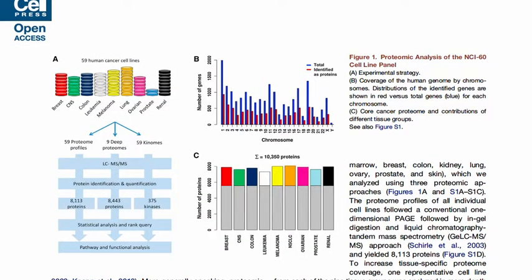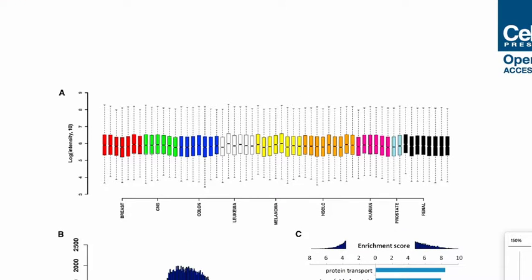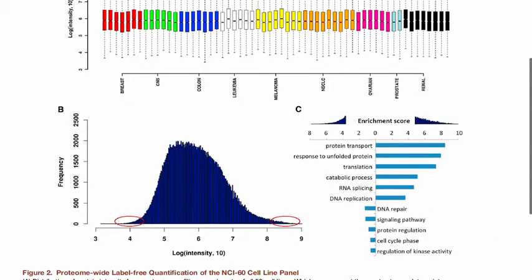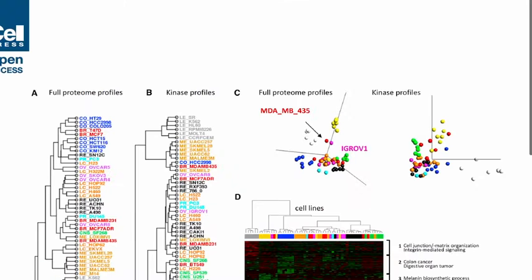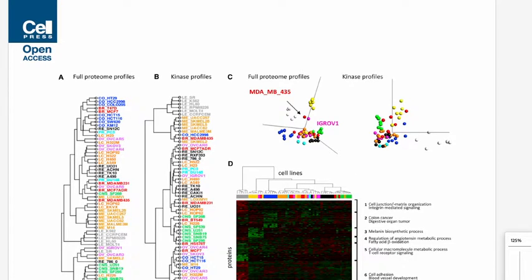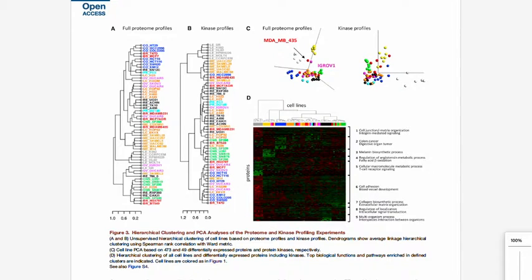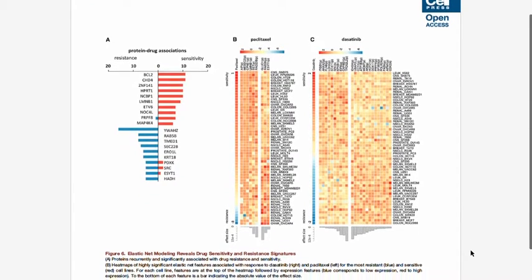Traditional analysis takes the peptide sequences derived from the MS2 scan analysis to identify the parent proteins and determine their abundance. Published reports refer to proteins and their abundance without reference to the underlying mass spec data. All of the expression comparisons and statistical validation is performed using protein-level data, meaning it is performed using a highly processed and curated subset of the data.